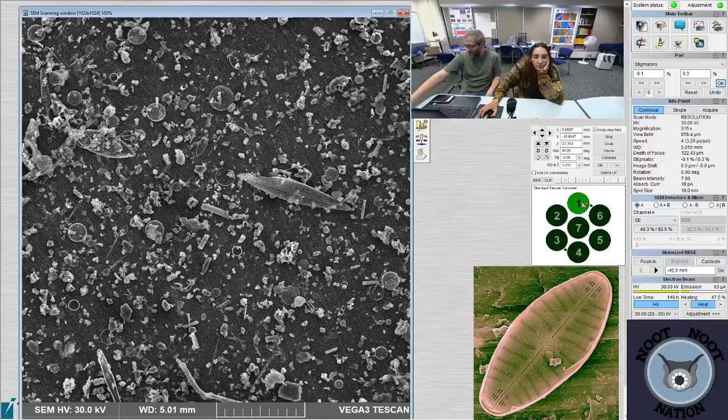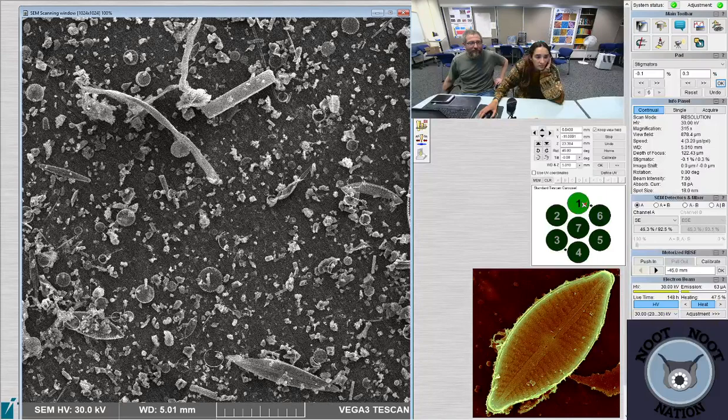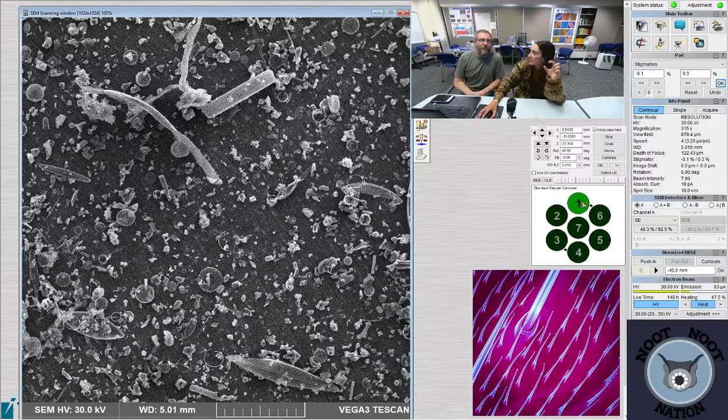Can we just blow on it? Well, it's inside a vacuum, so there's a slight problem with that. Can't really dust it off either. This one is the same one, right? Yeah, also an internal view, though. See the bright line around it? That's the silica thickening the lamina.